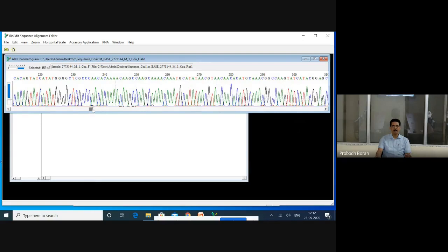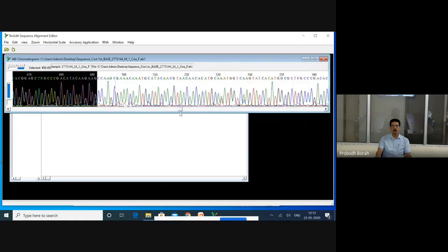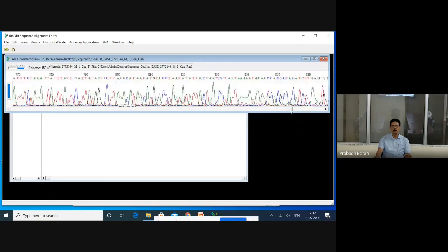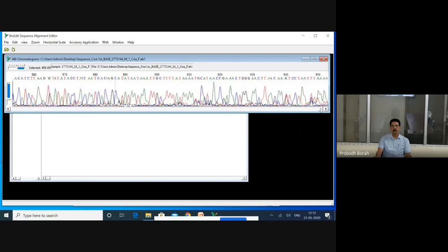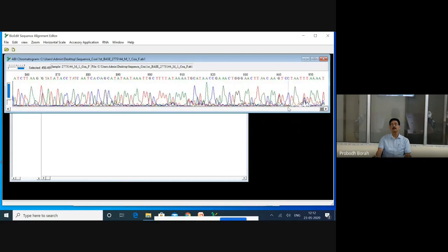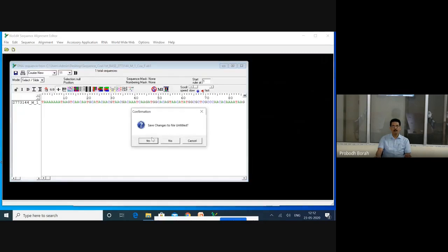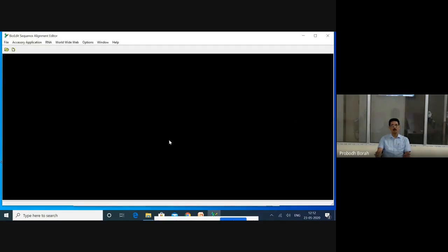This sequence I have given to you only to show that when you get this type of sequence, you should repeat the sequencing by again purifying the sample. We will close it because we will not use it - the forward sequence is not good. We will not use this particular pair of sequences because we need both forward and reverse.